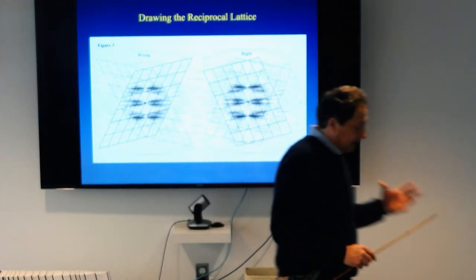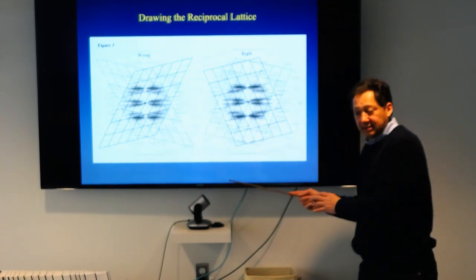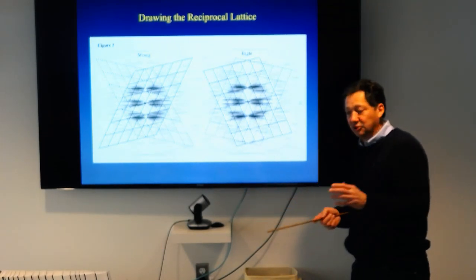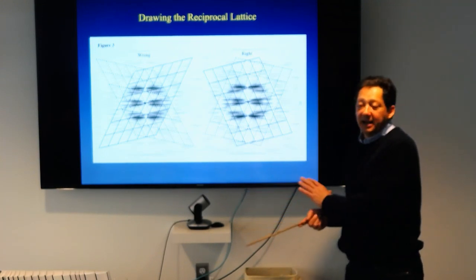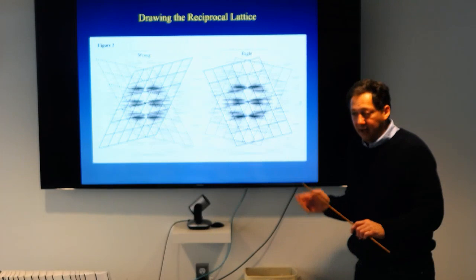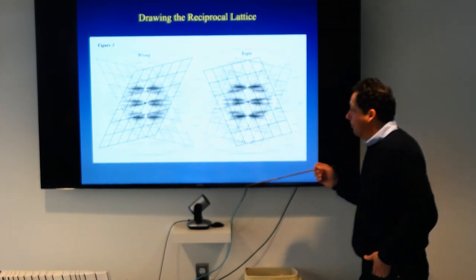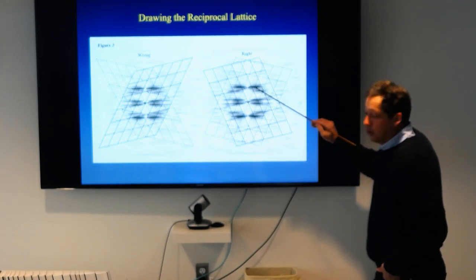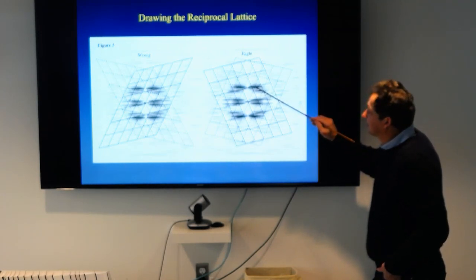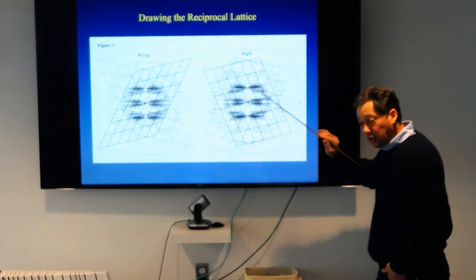Of course, that can get complicated, and it's not just in this lecture that it is complicated. It has always been the problem with helices when you don't know it, and getting it wrong is not impossible, particularly because these are not dots, these are just streaks. So where do you put this lattice point? Here, here, or here? It's not obvious.